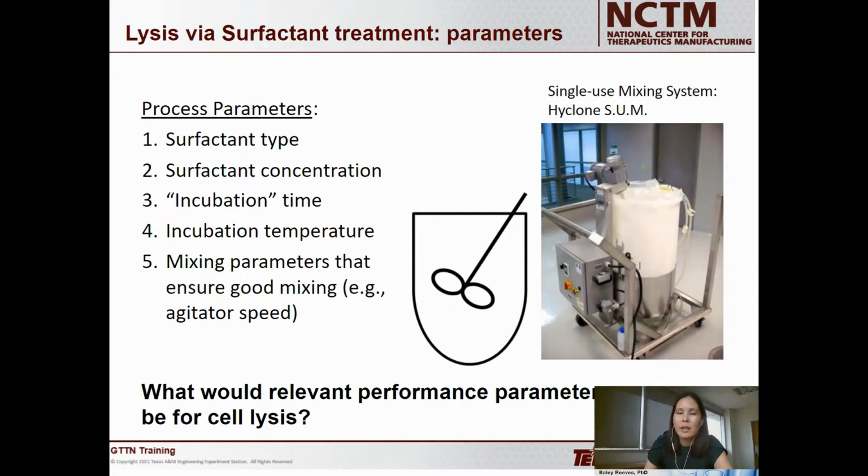If you're using something like a homogenizer to drive your lysis step, that is unfortunately not going to be compatible with a single-use process train. So depending on what is important to you will also help determine which unit operation you're going to choose for your particular process.